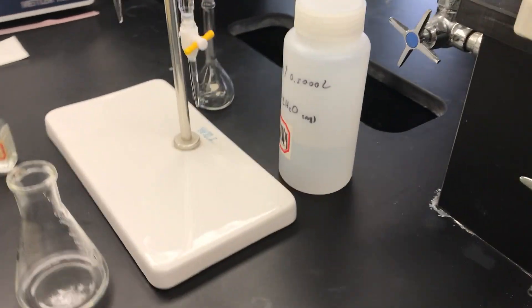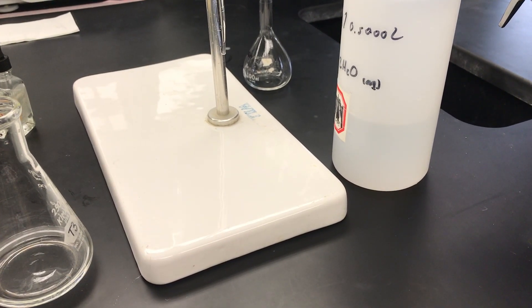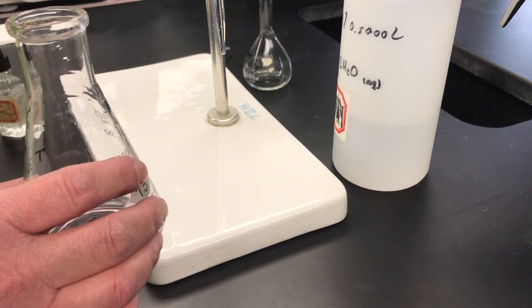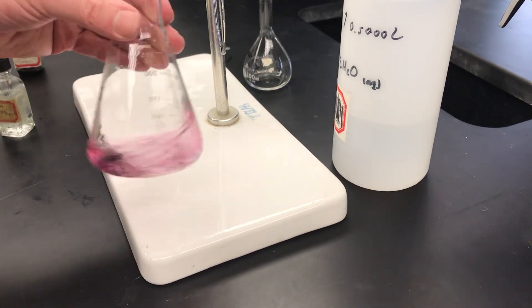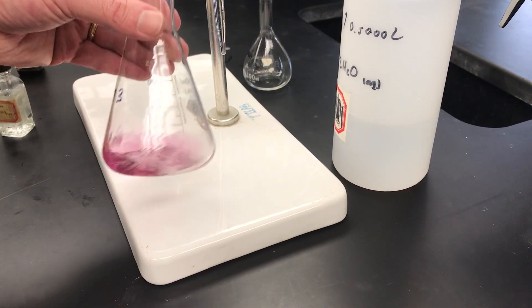At this point I'm going to set the camera up close so you can see the titration, and add the last couple of reagents. The next thing I'm going to put in is five drops of the Eriochrome Black T indicator. As you can see, that's a very pretty red solution. After stirring, it looks like a nice bright pink or reddish pink solution.